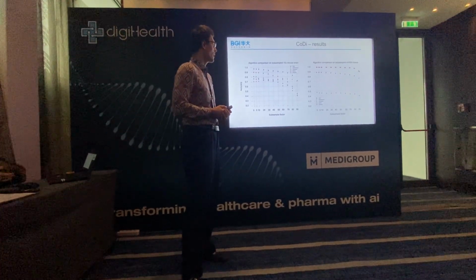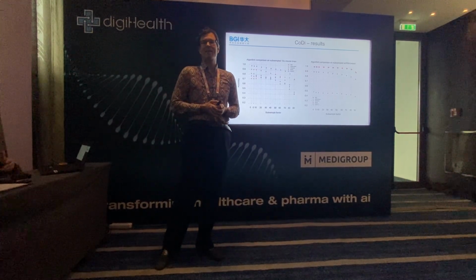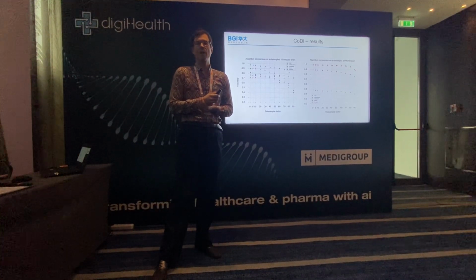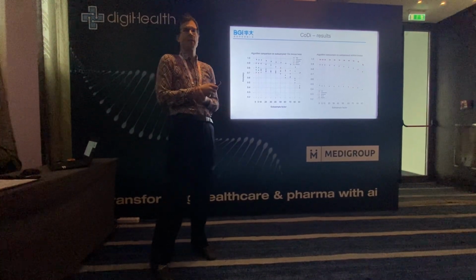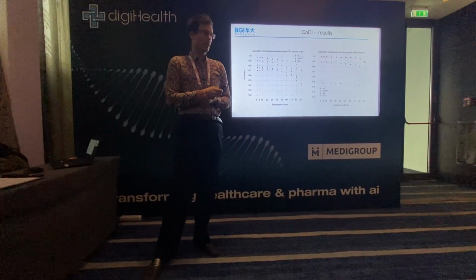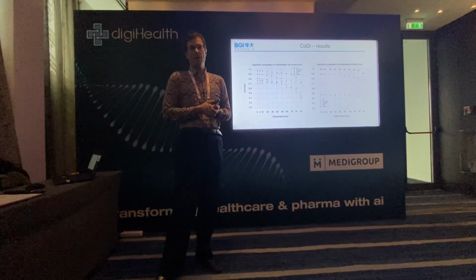And now when we obtain the annotations, we need to test them to see whether they make sense. The current problem with this entire area is that we don't have gold standard reference benchmark data sets. It's still a young area, and it's not like in DNA sequencing where you have multiple samples with very accurately reconstructed variants.